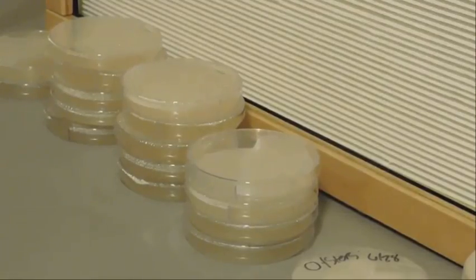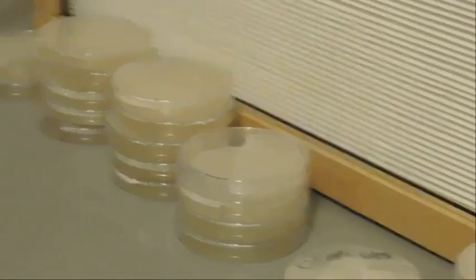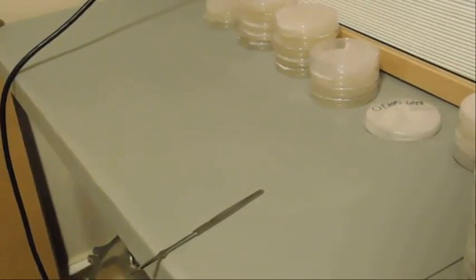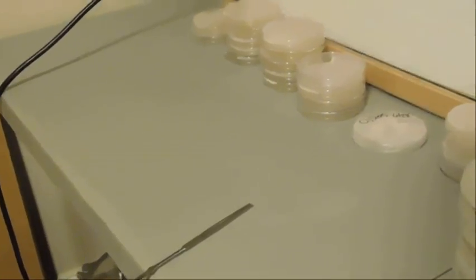Now that the dishes are poured and cooled down, you're going to grab your culture and transfer it. You're going to need a scalpel, and you need to flame sterilize the blade every single time — after every single dish. Watch how I do it.